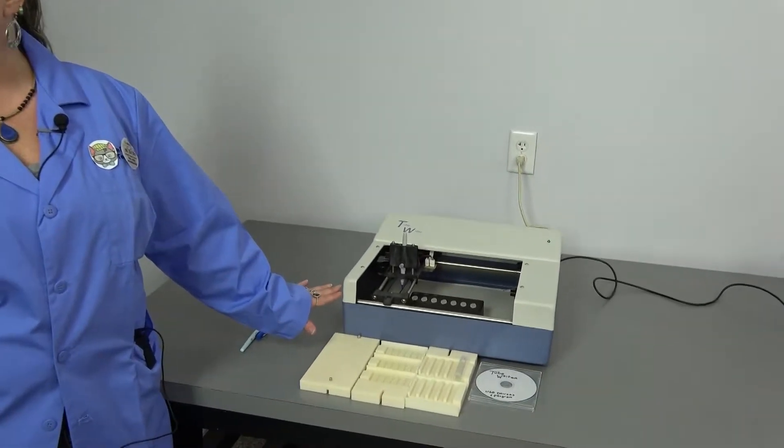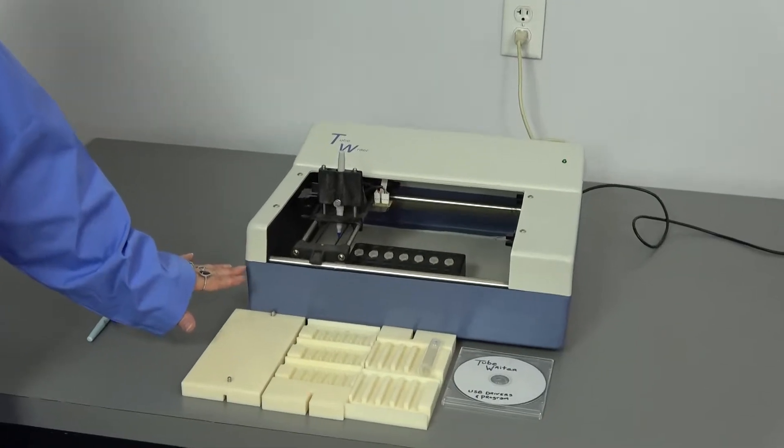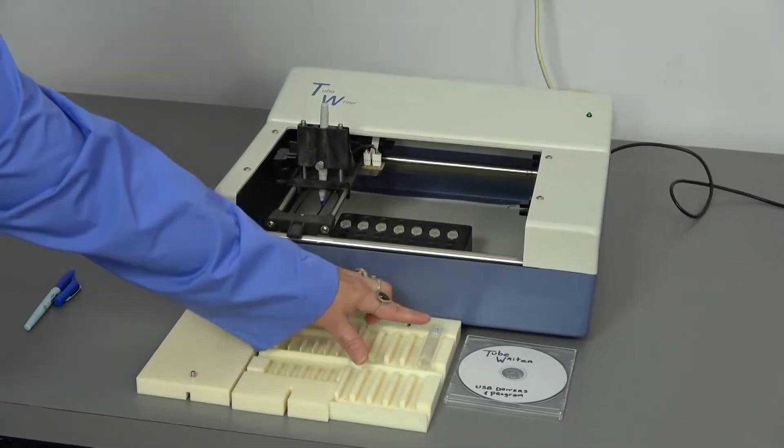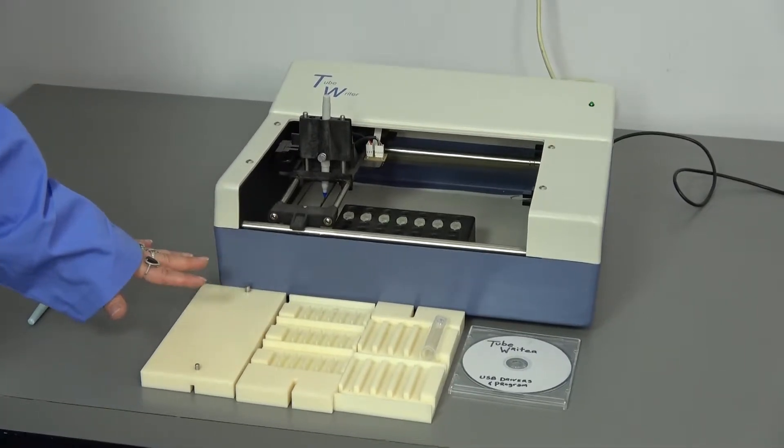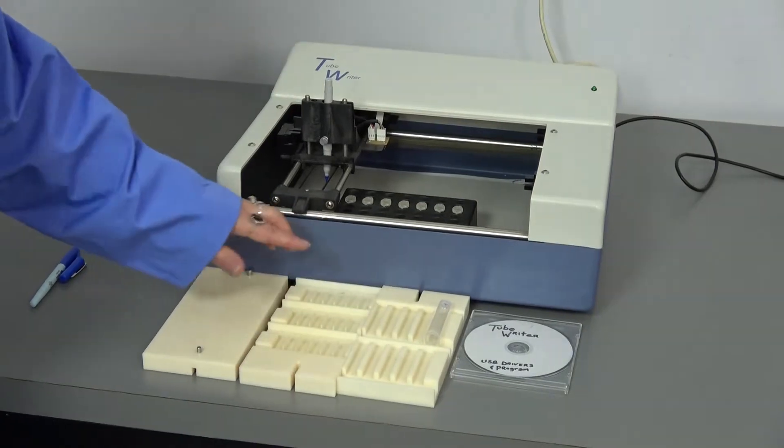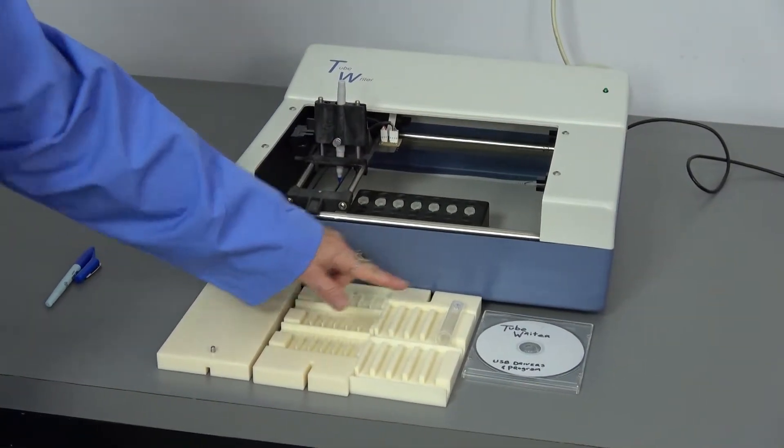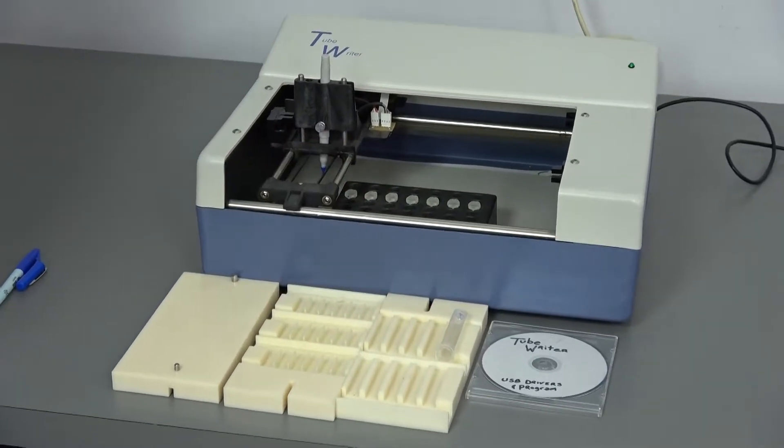This machine allows you to reliably and clearly label your tubes. It prints identifiers on the lids or the sides of tubes. You can program it to print the information that you want. You can change the racks so that you can put in microtubes or the longer tubes on the sides. We'll run it through a little demo.